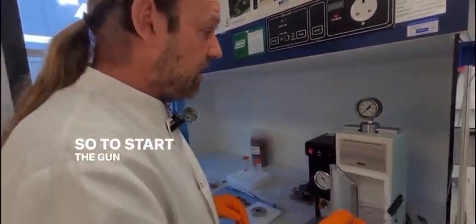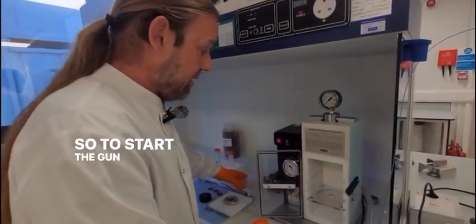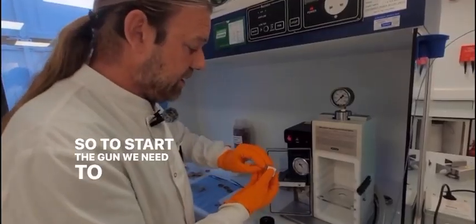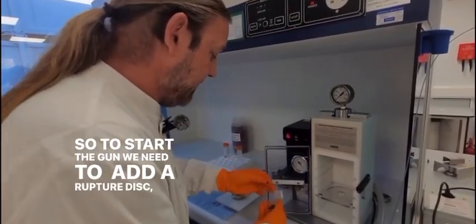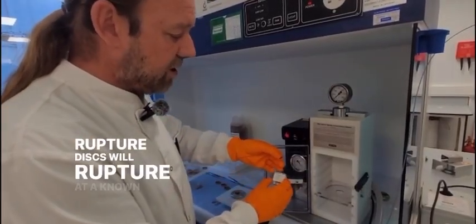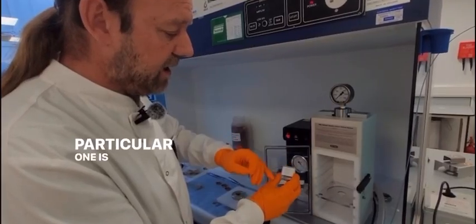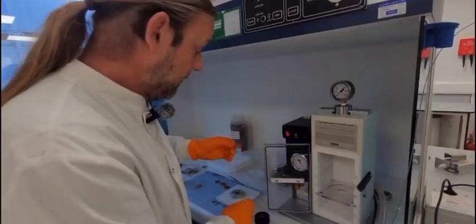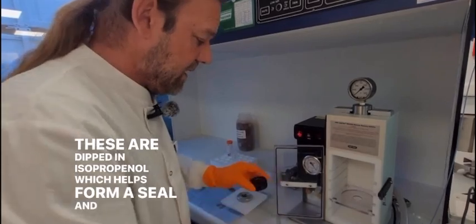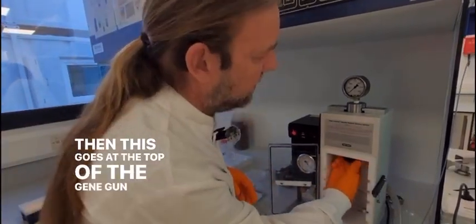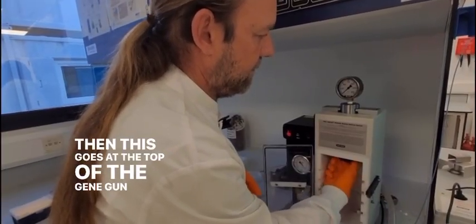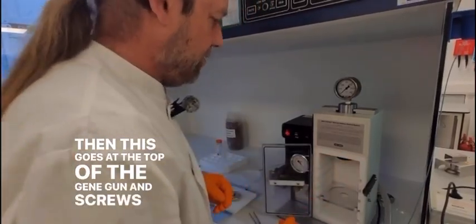So to start the gun, we need to add a rupture disc. These rupture discs will rupture at a known pressure and this particular one is 1100 psi. These are dipped in isopropanol which helps form a seal and then this goes at the top of the gene gun and screws in like that.